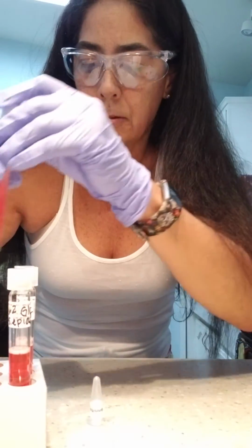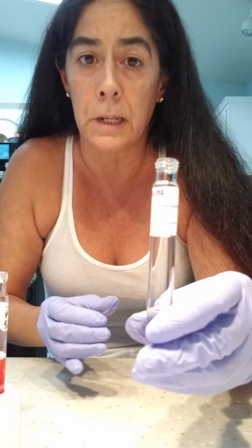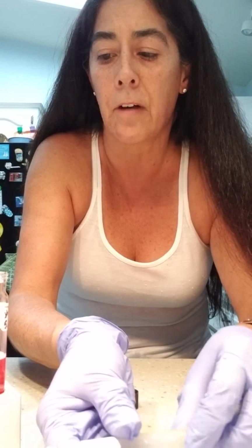Okay, so I'm going to do the other 2 vials. I'm going to pause this now to finish this, and then I'll come back for the second part. Okay, so I'm back. So now I'm going to sterilize my vials, and I'm going to put 4 drops of each in each of these vials. I'm going to put the 4 drops of the epidermidis in the epidermidis vials that are labeled, and I'm going to put 4 drops each of the Cerevisiae in the pertaining vials that are labeled with that organism.